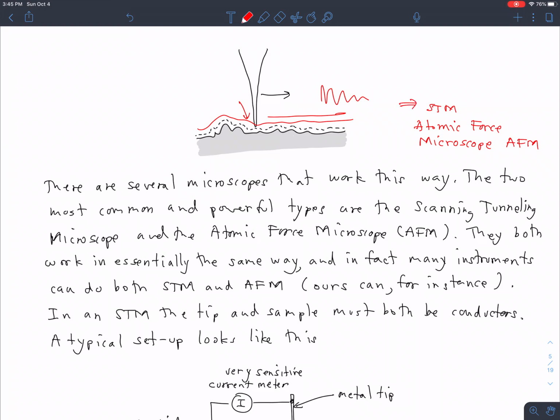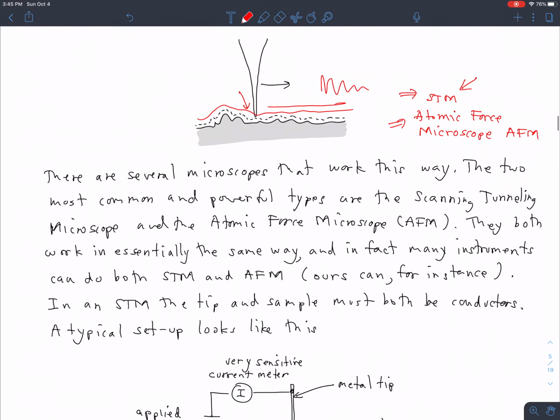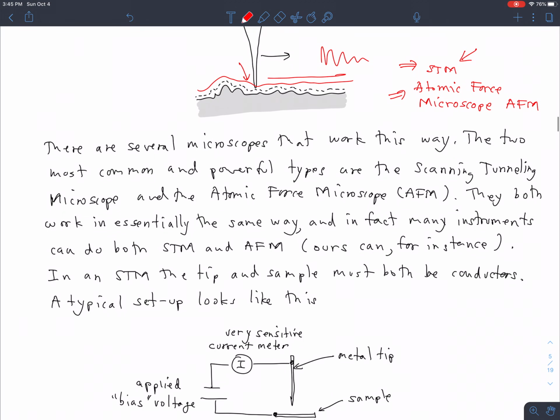And the reason for working on STM is that it has higher resolution than AFM does. AFM typically has resolution of a few nanometers. STM, on the other hand, can oftentimes see individual atoms, resolution on the angstrom scale. And then there's a whole bunch of other kinds of microscopes.